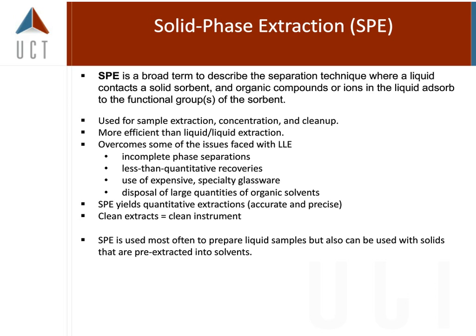And I never thought that I'd be applying it then to some of the LC work that I do, but I use this to try to teach my group, but also to try to best understand, with all of the phases that UCT can supply, how to understand some of these troublesome compounds that seem to give everyone difficulty, but when you start expanding into large groups of molecules, large groups of compounds, and doing one extraction, it doesn't necessarily always work.